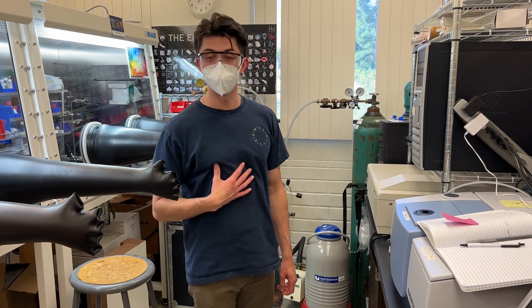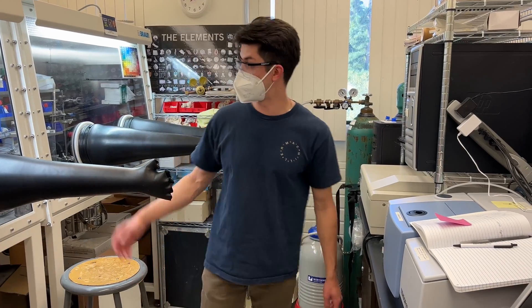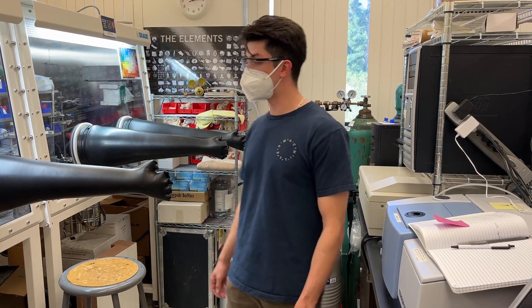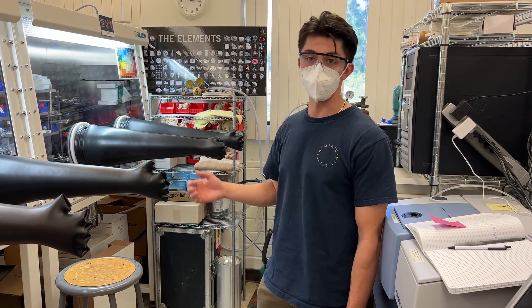Hi, welcome to the Stevor Lab. I'm Christian and today I'm going to be showing you how to properly and safely set up a cold trap for use in a glove box. The cold trap is used to remove solvents from the glove box along with collecting solid products after your reactions.